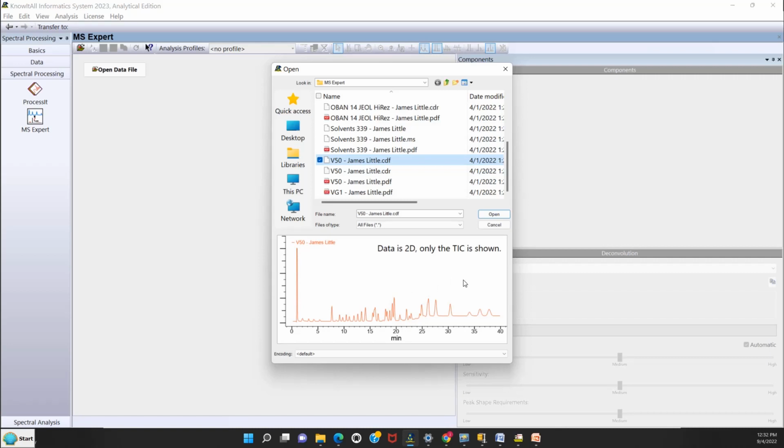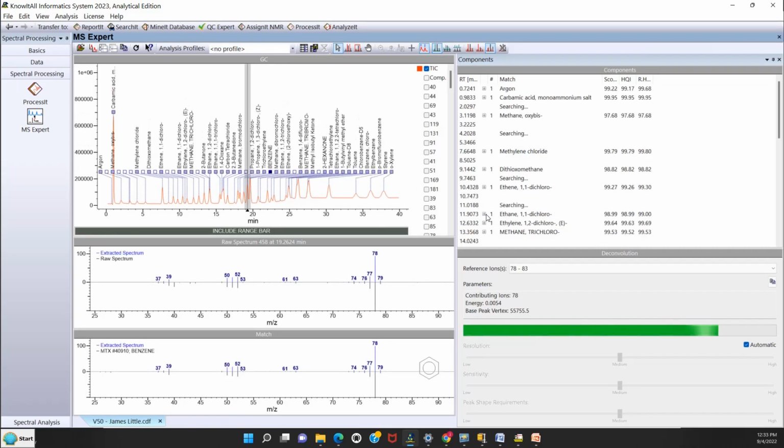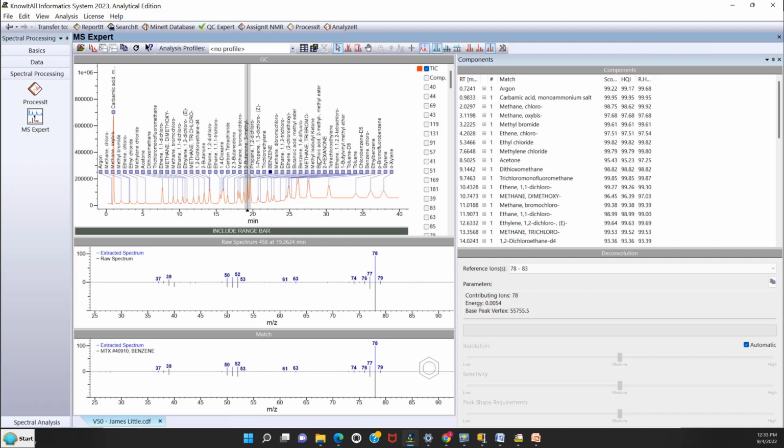You can see the chromatogram that is one that we processed manually, but now when we open it, it'll take out all of the background here. And if any compounds are not well separated, looks like there's a shoulder here, it'll automatically separate those components via the program and get good results for the mixtures. So let's open the file. What's happening is it's doing all that work, but it's doing it amazingly fast. You can see all the identities being populated, and it searched essentially for all of those components that were here. It did 1.2 million spectra compared to the unknown to find the best fit, which is really amazingly fast.